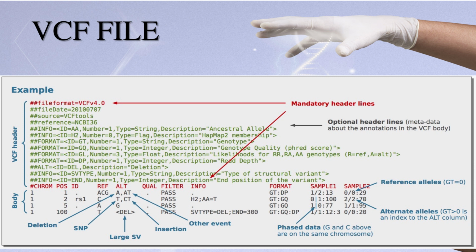Following this, the next section is the header section, represented by a single header line prefixed with a pound symbol. Subsequently, the file transitions to records, constituting the data lines. These data lines contain various details about genetic variants, and the subsequent slides will delve into the specifics of each section. Initiating with the metadata lines positioned at the file's outset.